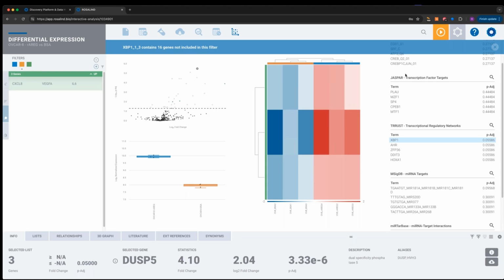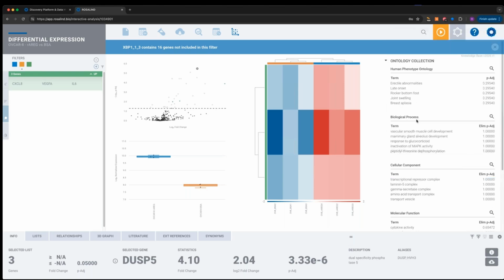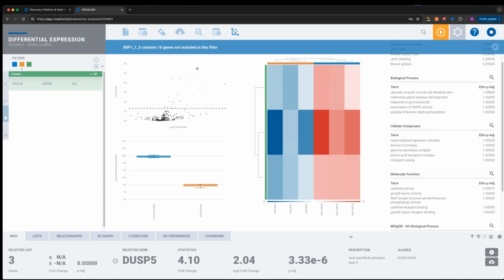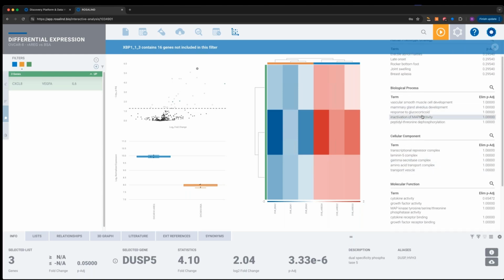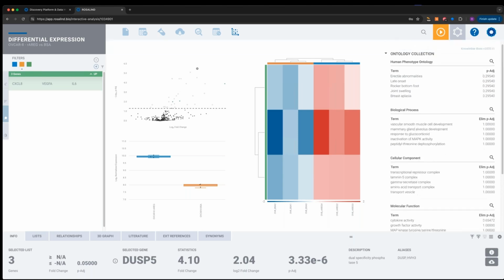There's a few other things I might want to show you here before I move on. There's also this ontology collection, which is quite popular and useful here. If you're familiar with GO or gene ontology, this has been around for, I think, a couple of decades now, but that's also available within the Rosalind platform. You'll recognize that as biological process, cellular component, molecular function. Now, in this case, none of these terms were significantly enriched, but in other cases they are. It just depends on the context of your experiment. So Rosalind does contain gene ontology, which is one of those best practices, gold standard pathway approaches for your data. So that's found here.